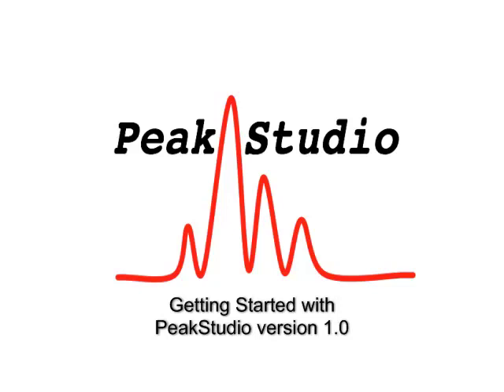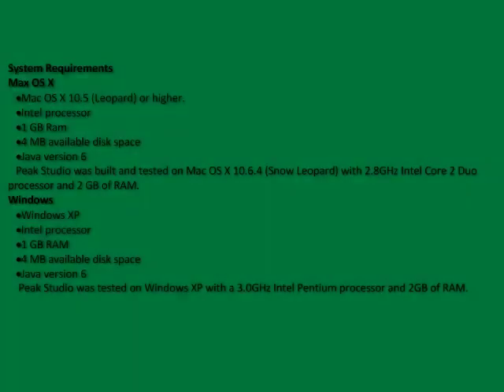I'm Tim Hamp, and in this video, I'll be taking you through some features that will help you get started in PeakStudio. Before beginning, please confirm that your computer meets the following system requirements.